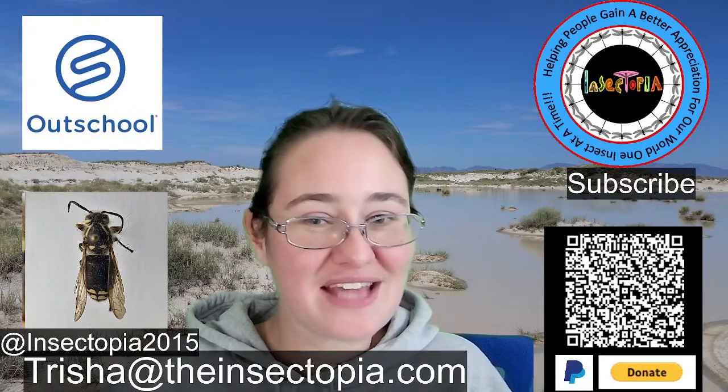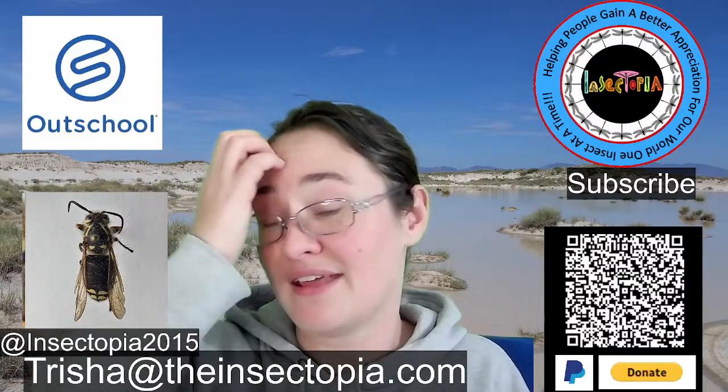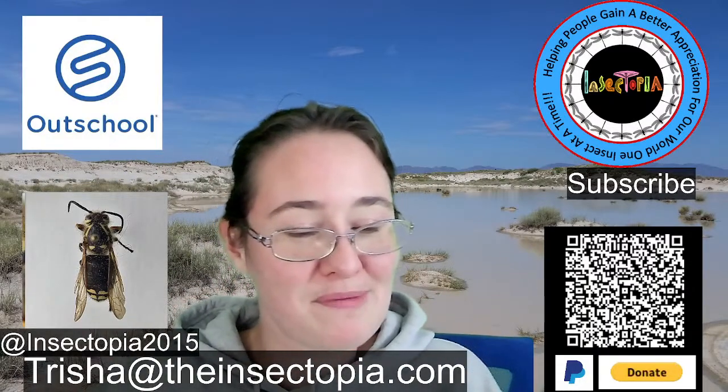Alright, so Susan says, someone different from the queen. Perfect. I have a two-node ant that looks kind of wonky. It's got a really thin waist. So we might be able to do that one too.